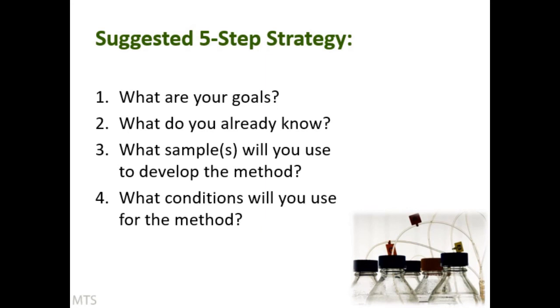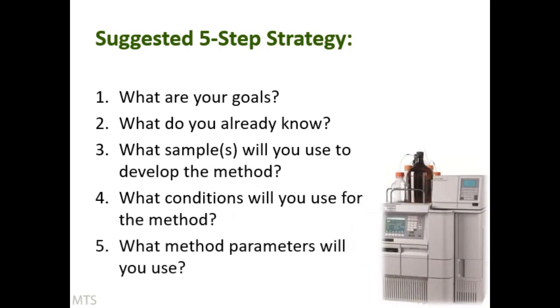And then we're ready to do some screening if necessary. And then finally, we're into optimization. So our strategies here are one factor at a time. And if we have the option of it, maybe DOE and maybe computer modelling. Okay, so that just gives you some ideas around strategies.